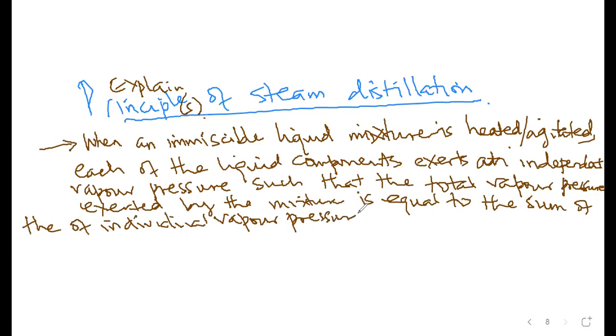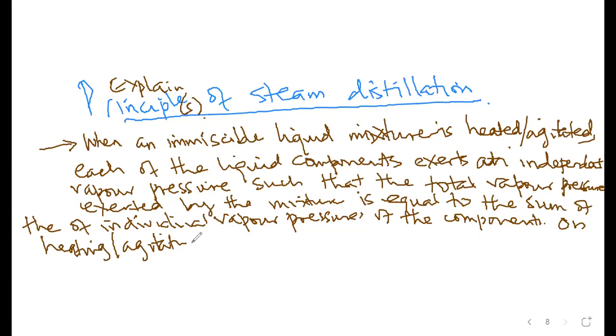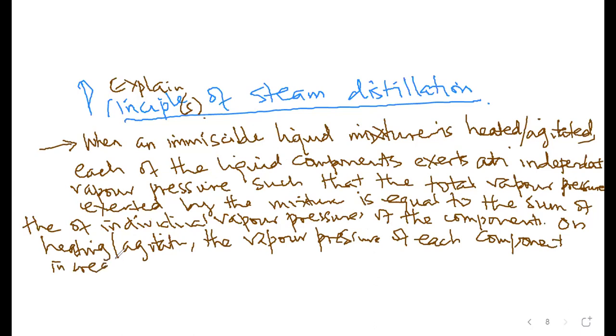On continued heating or agitation, the vapor pressure of each component of the mixture increases.